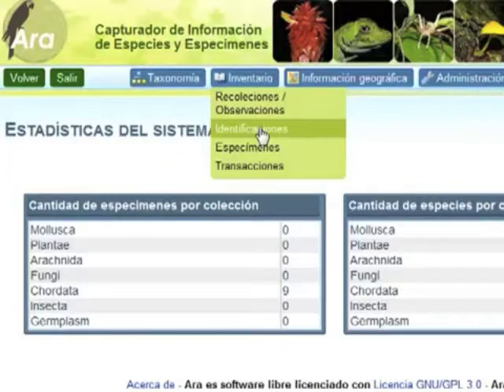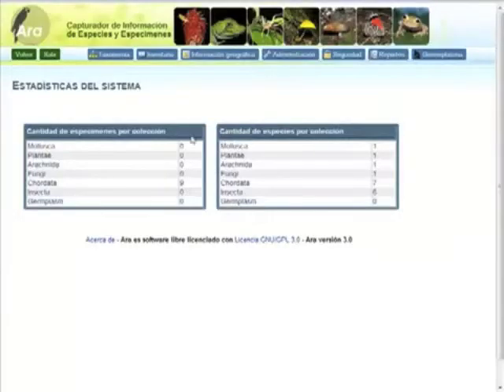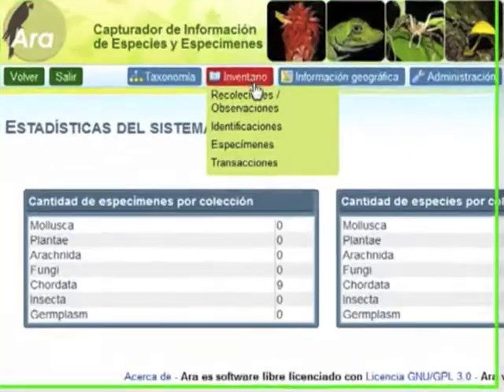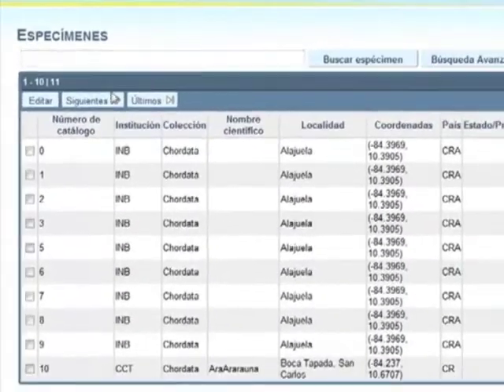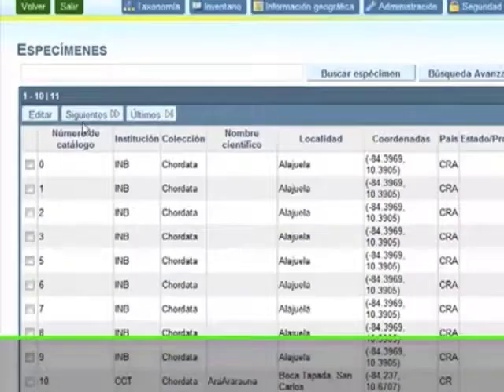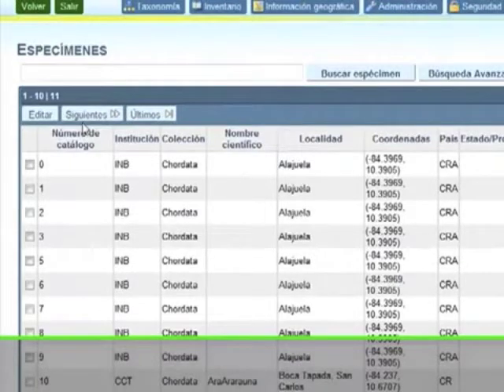Editing a specimen. On the inventory menu, select the specimens option. On the result that shows, you can find information related to institution, collection, and coordinates among others.